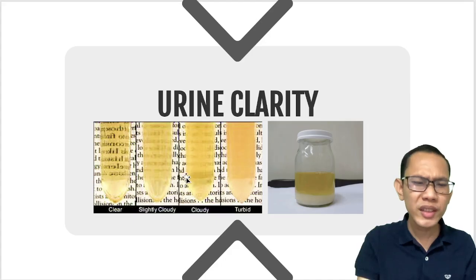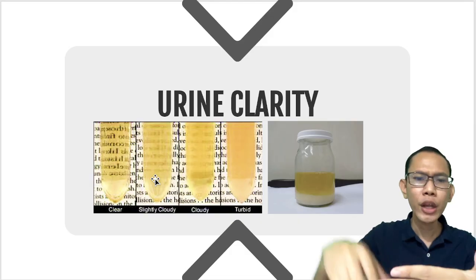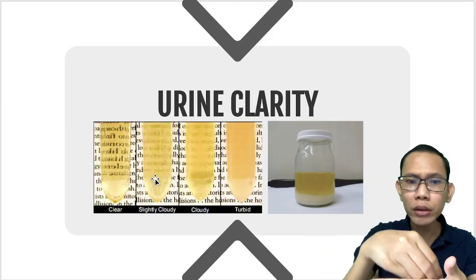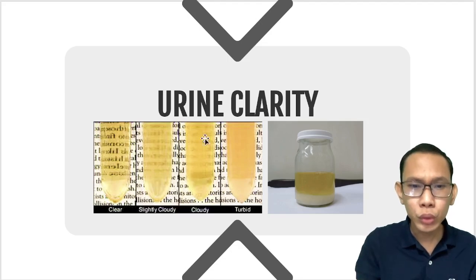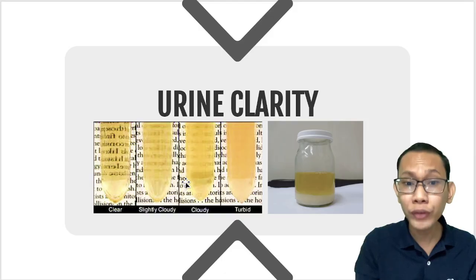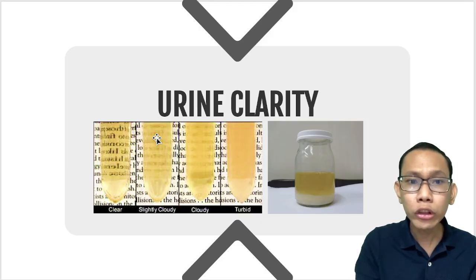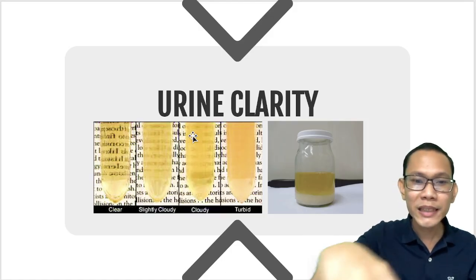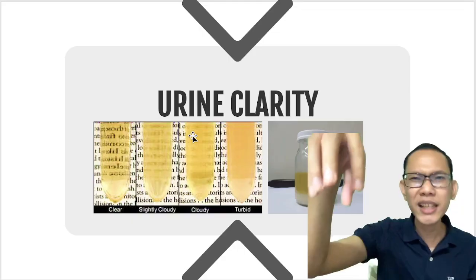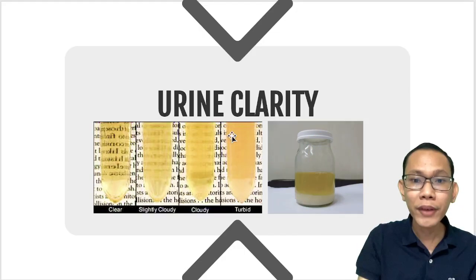So, Doc, do you really need na you have a print there at the back and then you have to really transfer it in the urine? Actually, through time or through experience, you don't have to do this anymore as long as you are already confident that this is clear, this is cloudy. Your experience really will help you determine your urine clarity as fast as you can. Sometimes, sa sample lang namin, tinitingnan lang namin, as long as there is a good source of light, then you could directly identify the urine clarity.